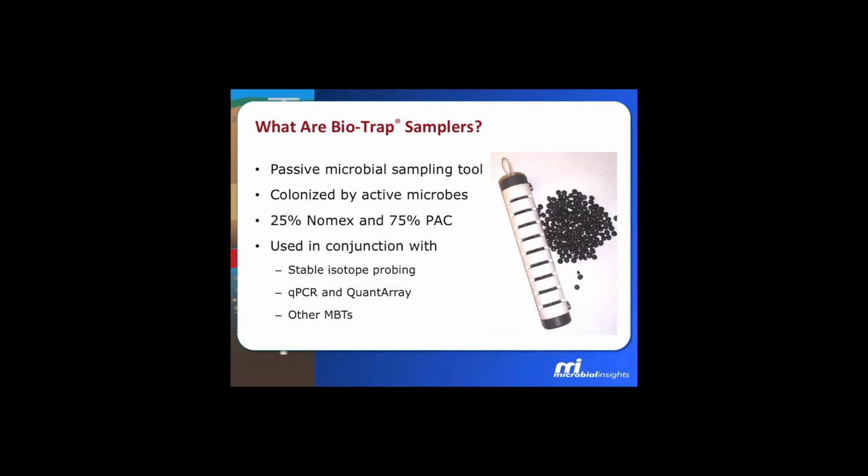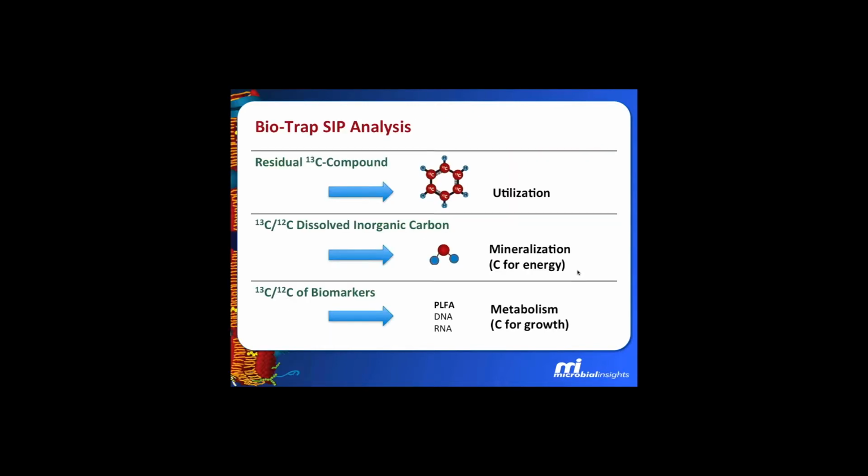So what we're going to do is take these beads, and it's what's inside the in situ bioreactors that Kerry's going to show you in a minute. We're going to put those down into the bioreactor or into our monitoring well. The organisms are going to colonize there and start to utilize that compound that we've loaded on, or maybe we don't have a compound on there and they're just absorbing compounds that are present in that well. The organisms are going to start to utilize those compounds as a carbon and energy source, and then we can see what happens and what organisms are present.